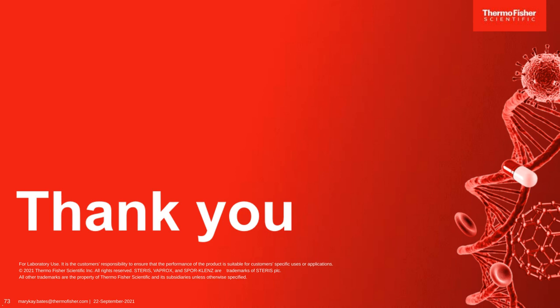I know that everybody's urge is to use higher and higher concentrations of disinfectants, but keep in mind that that can affect the quality of your stainless steel, glass, and other materials in your equipment over time. So we tend to stay with the lowest effective dose, and we would absolutely recommend 3% as a maximum. Thank you, Mary Kay. I just wanted to clarify 3% hydrogen peroxide as a manual disinfectant. Thank you, Jennifer. Oh, sure. Thank you so much. Sorry that I interrupted.